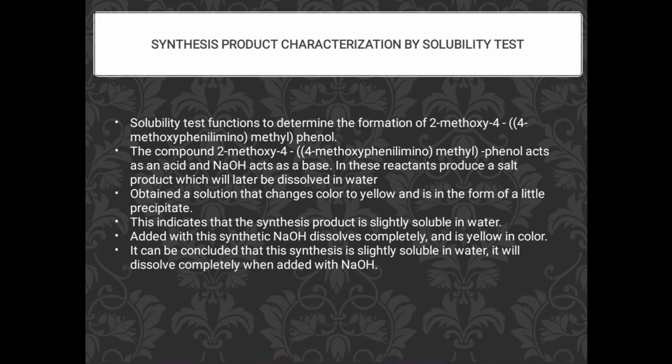When added with NaOH, the synthesis product dissolves completely and is yellow in color. It can be concluded that the synthesis product is slightly soluble in water, and it will dissolve completely when added with NaOH.